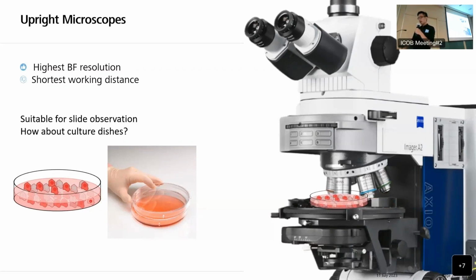Here you can see this doesn't work. We cannot just put the petri dish under the objective lens, because the most common objective lenses cannot be placed in the buffer, otherwise they may be lost, or the lens will no longer be transparent.